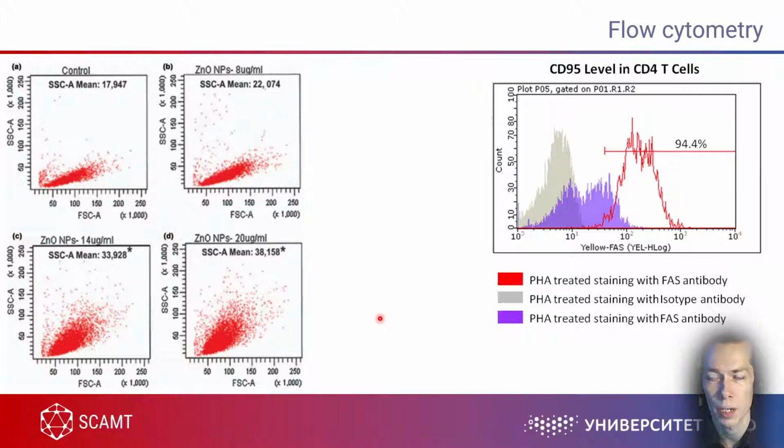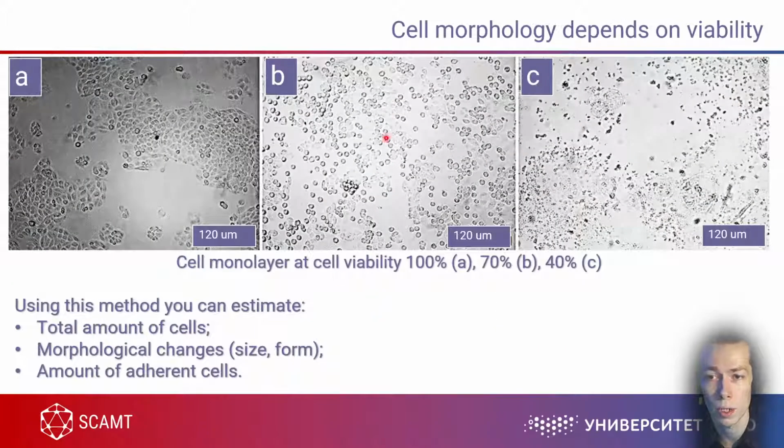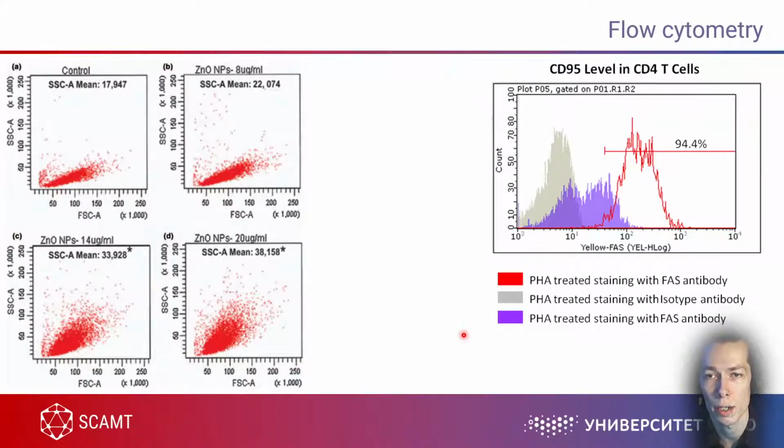It's flow cytometry, and I wouldn't talk in detail about the flow cytometer, but still, for example, here you need to count with your own eyes or with some special programs, and you still need to obtain some images. Using a flow cytometer you can count thousands of cells. For example, like this, I believe maybe 30,000 or 40,000 cells can be counted. And what is so special about flow cytometry?